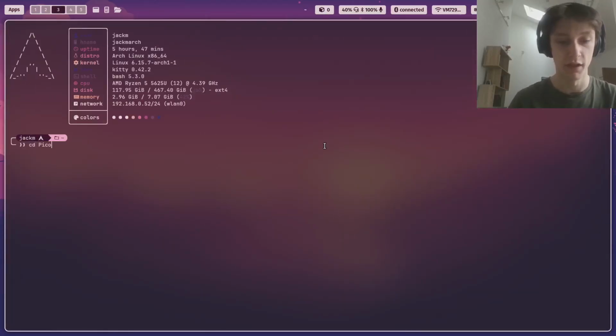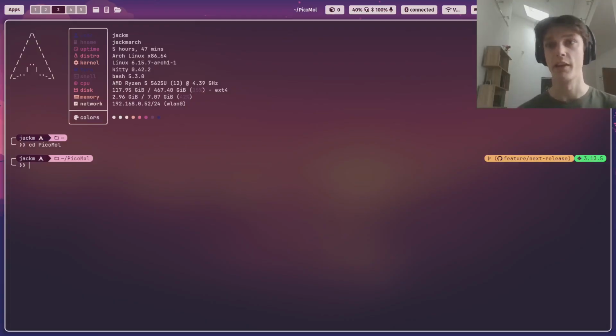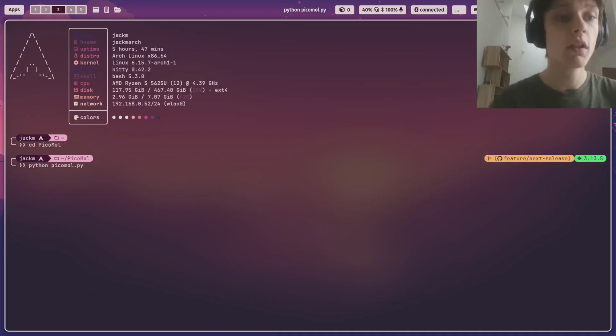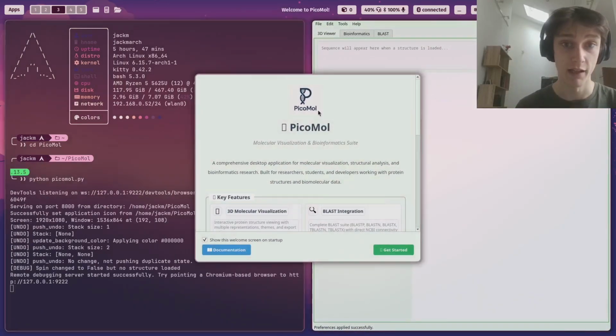So once again, I'll open up the project. When I actually release this version, I'm hoping to get a package version out for Windows in an exe form, a DMG for Mac, and I'm hoping to get it on the AUR for Linux and for other Linux distributions. You can follow the instructions and run it on your own system because Python comes pre-installed. I'm also going to get rid of the headless.